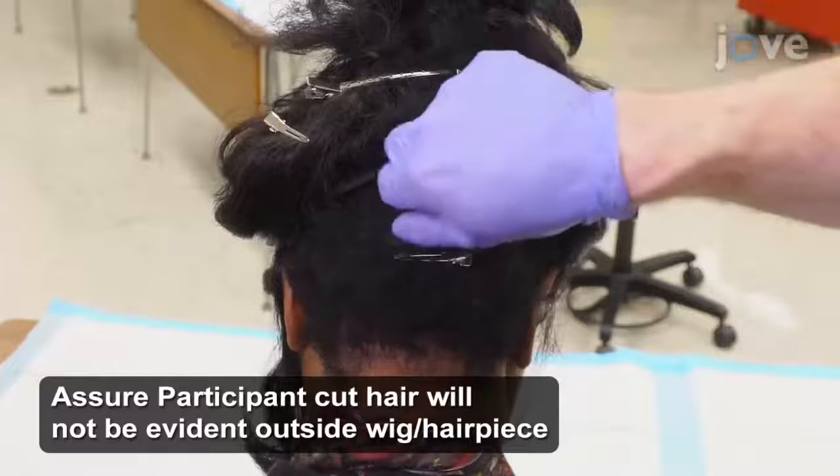Gently pull the hair in the sample site to allow measurement from the scalp to the ends of the strands.